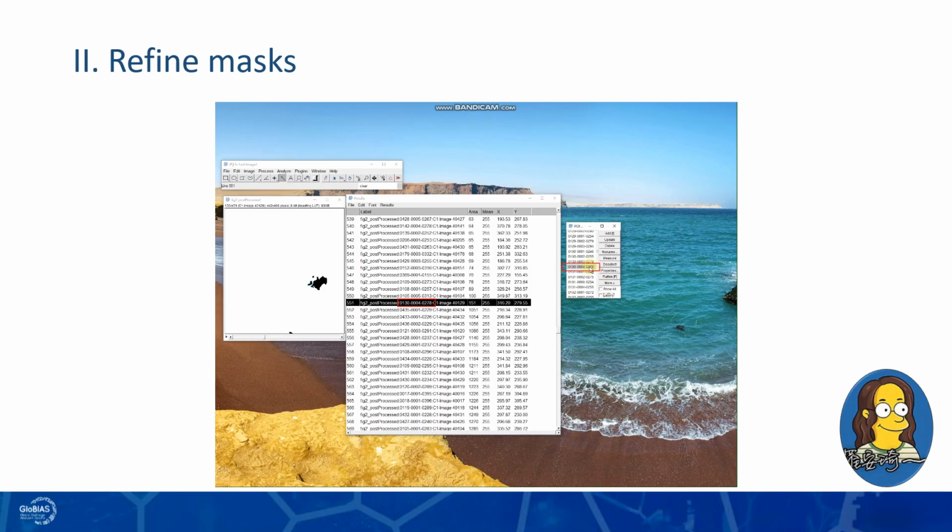And from the image, we can confirm that row 551 is indeed a debris object, while row 552 corresponds to the target cell.